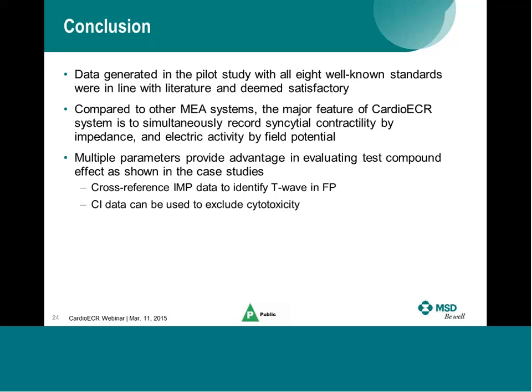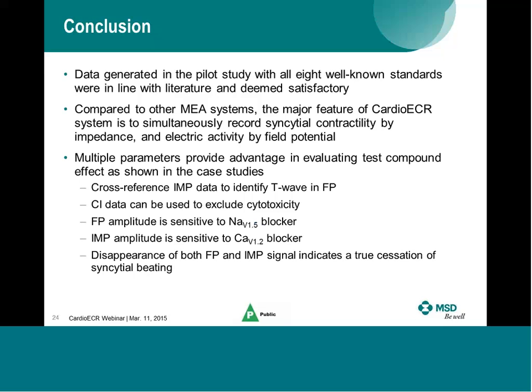The cell index data can be used to exclude cytotoxicity. The field potential amplitude is more sensitive to sodium channel blockers, while the impedance amplitude is more sensitive to calcium channel blockers. And when both signals disappear, we can believe it's a true cessation of syncytial beating.